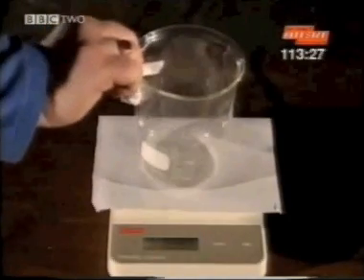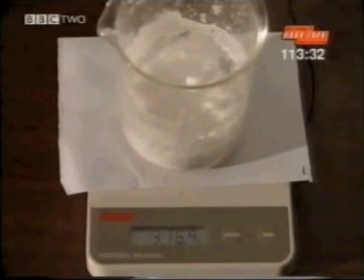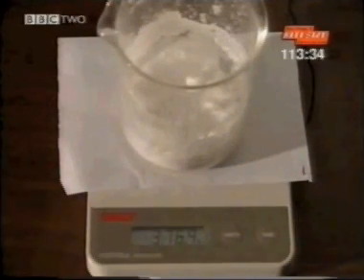By subtracting the weight of an identical empty beaker from the weight of my salty one, I can calculate I have 94.8 grams of salt.